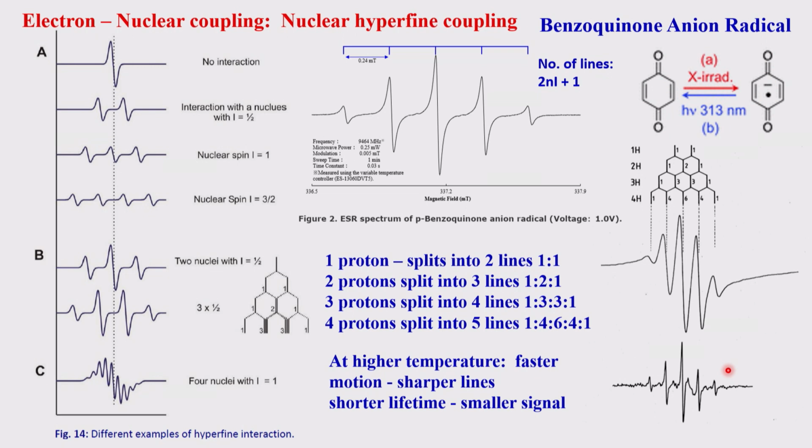To get a feel of what I mentioned, both for the hyperfine and the super hyperfine, let us start going through that together. Please join me in going through the details one by one so that you will understand better. Now, 1 electron, nothing is there, just one single line. If this electron is present in a nucleus that has I equal to half, then you have 2 into 1 into half plus 1, that will be 2 lines.